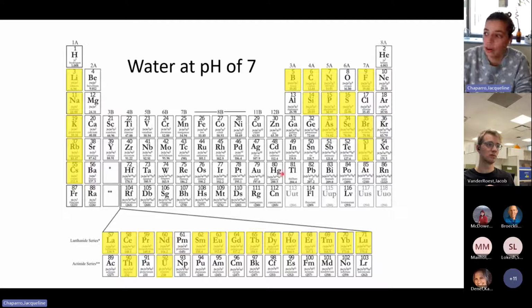I just want to point out that even though some of these elements are highlighted, it doesn't mean that we can measure them with ICP-MS, for example fluorine, nitrogen, and carbon. So if you want to measure water, a lot of times it's good to stabilize, and I tell people to stabilize their samples with a small 1 to 2% volume to volume of nitric acid.